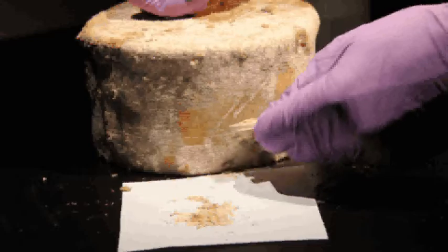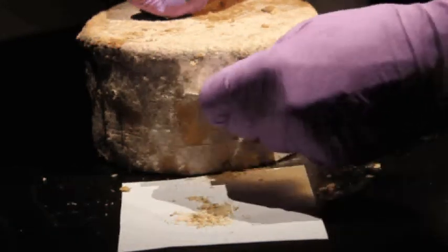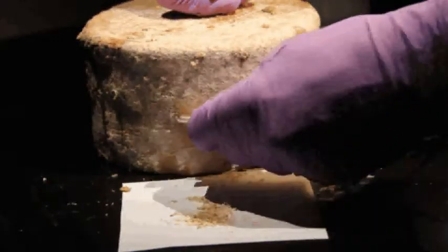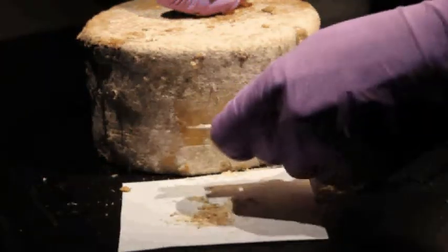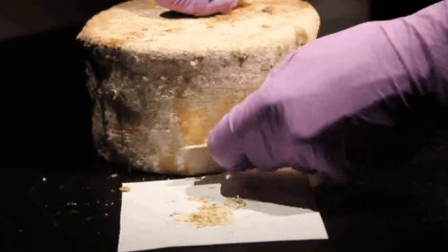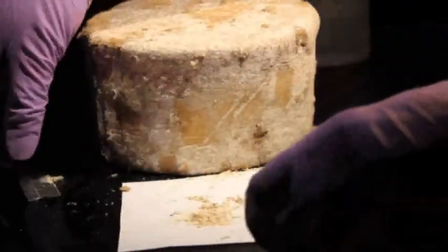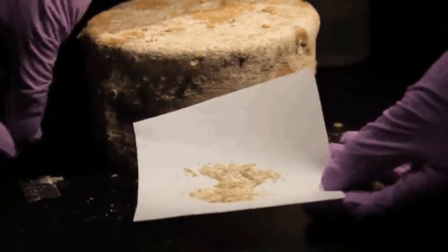For our study, we need you to scrape an area about one and a half to two inches by two inches, depending on the size of the cheese. We don't want to ruin your cheese, but we need enough of a sample so we can extract DNA and also take environmental measurements. That's a pretty good-sized sample collected from that particular scraping.